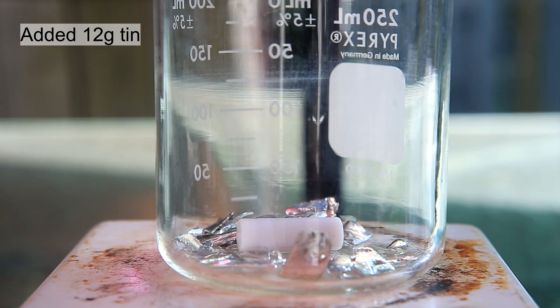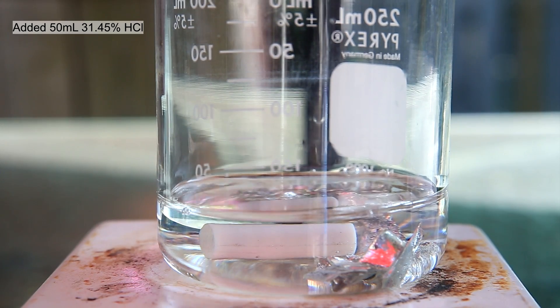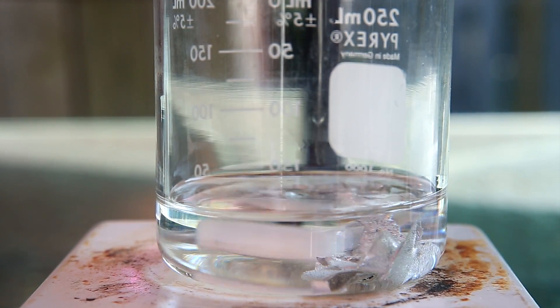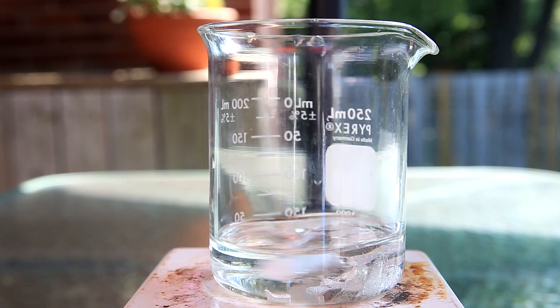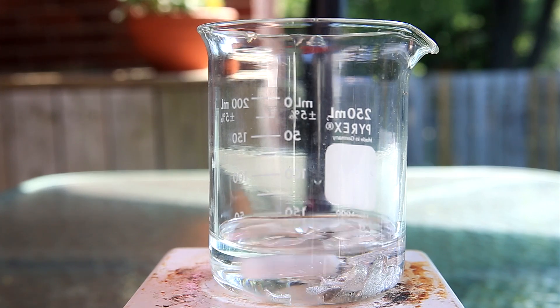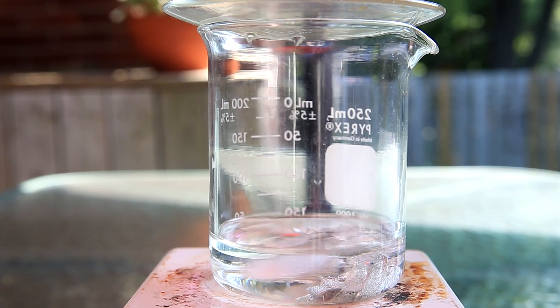12 grams of clean tin was added to a beaker, then about 50 milliliters of 31.45% hydrochloric acid was poured in. The tin starts to react with the hydrochloric acid and there is some bubbling. However, at this rate it would take forever, so it needs to be heated. A watch glass is placed on top to prevent vapors from escaping.